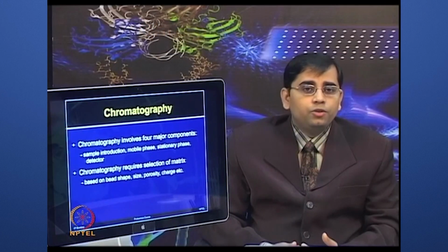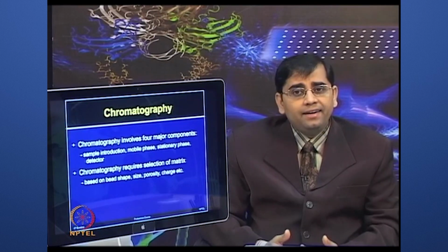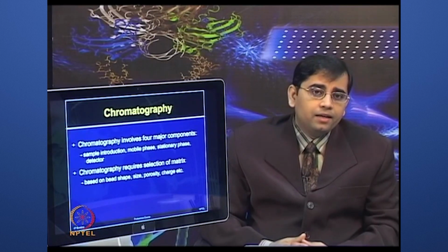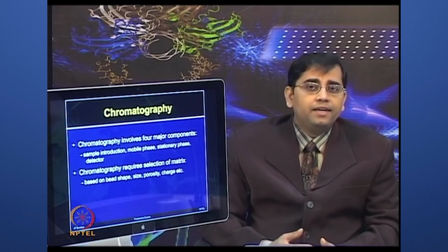In addition to the functional group type, the charge, distribution and density, as well as elution conditions such as the pH, the ionic strength and gradient shape.